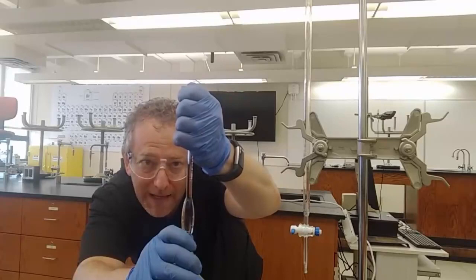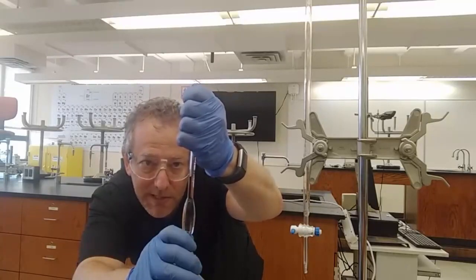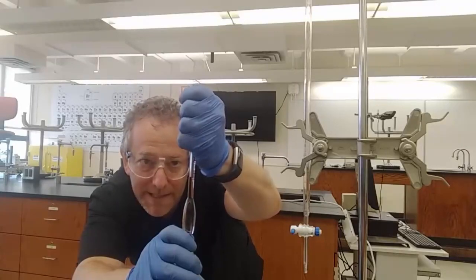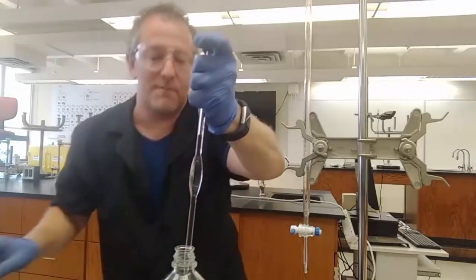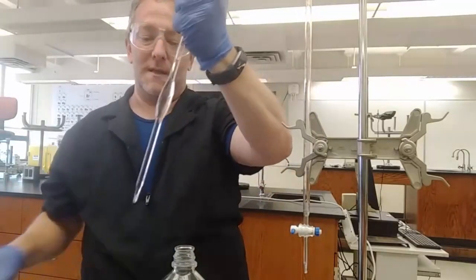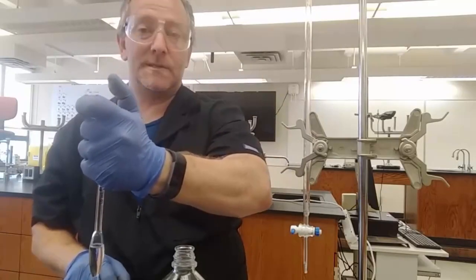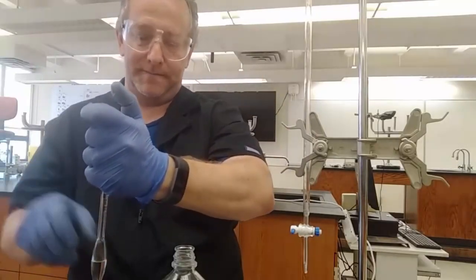with the pipette bulb, I can get the meniscus exactly on the TD line, which again, on most pipettes, there is only one line, so that's the line you'd be going for, because most pipettes are just marked TD. Meniscus is exactly on the line, then I can put my finger over the top, maybe I'll wipe off the outside beforehand this time, and drain into the second Erlenmeyer flask.